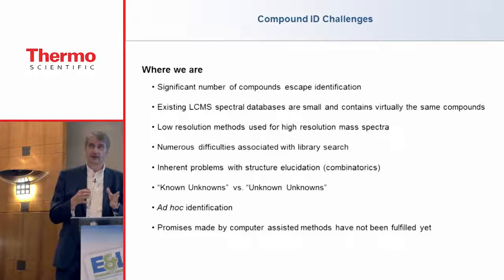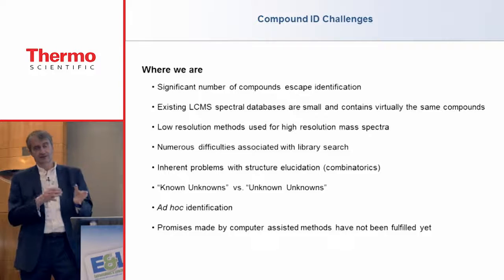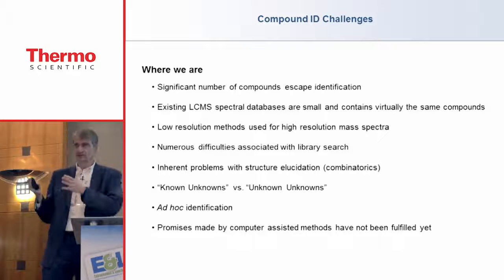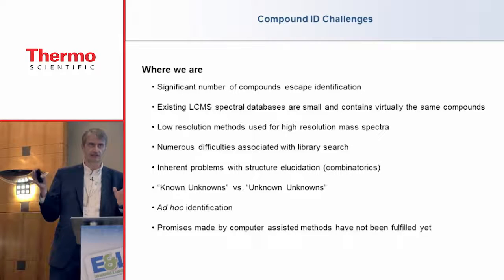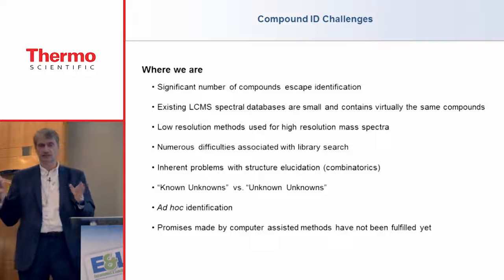I will try to explain to you why, but not to make the already complicated story even more difficult. So I will only focus on the LCMS. I will not touch other analytical techniques like GCMS or NMR or others.